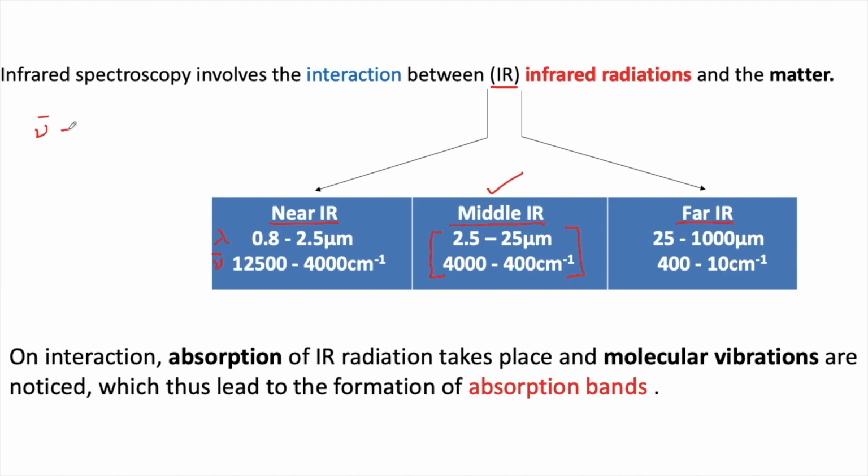The main thing which I would like to add here is that the wave number is inversely proportional to wavelength, or we can say lambda. And using this equation or expression, you can easily carry out all the conversions which are shown here in the table.